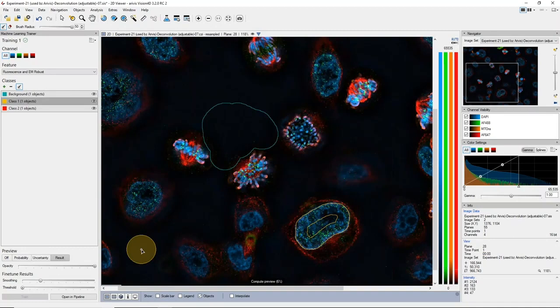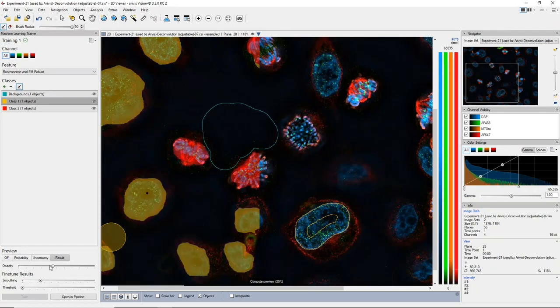Again, as I said, it's pretty computationally intensive, so it does require a little bit more patience, but it can, in many cases, provide much more accurate results, especially for complex data sets like EM data, where you don't typically have multiple channels. You don't typically have a nice differentiation in terms of intensity between background and objects. It's more to do with textures, etc. And so you can see this machine learning can be a lot more efficient at detecting certain object types.